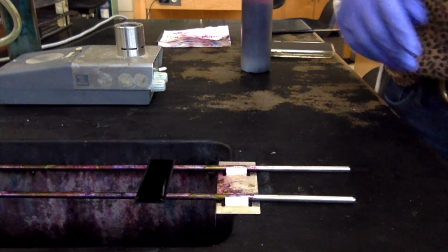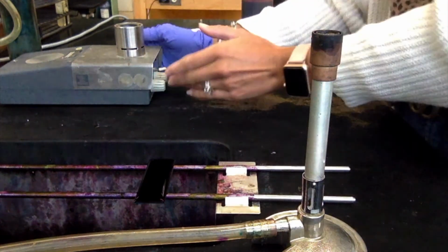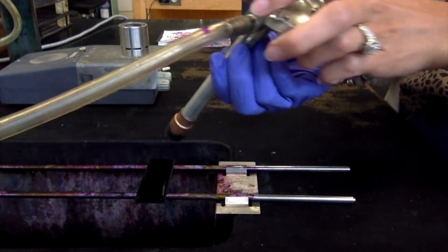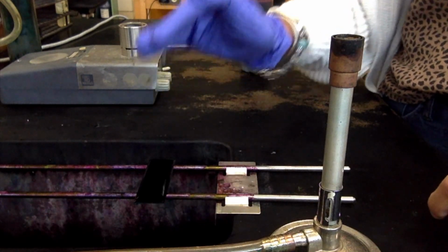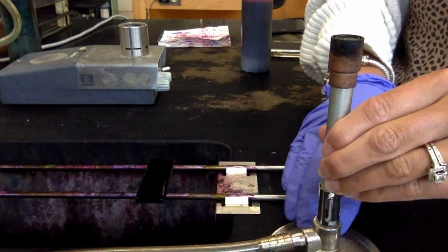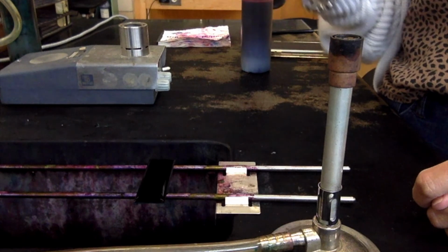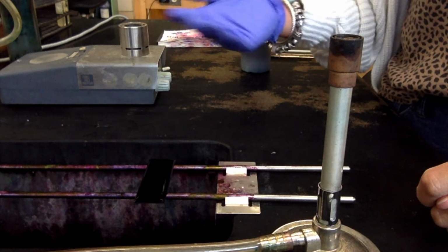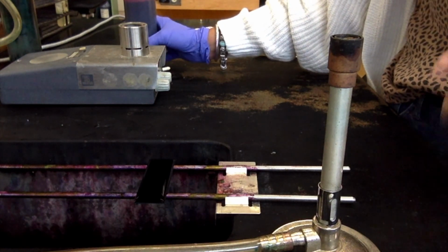Now, let me explain the Bunsen burner for you. You have to use a Bunsen burner to do this. You can't use a Fireboy because we clearly can't pick it up and turn it over. You have to be able to pick it up and turn it over to apply the fire directly to the stain. And we want to put the fire directly on the stain. If you don't do that, it's not going to heat it enough. But what you don't want to do is sear or cook your smear itself. You don't want to overheat it. If you cook the smear itself instead of the stain, your cells will basically crack open and burn, and then you're not going to be able to see anything on the microscope except for scrambled eggs, and we don't want that.